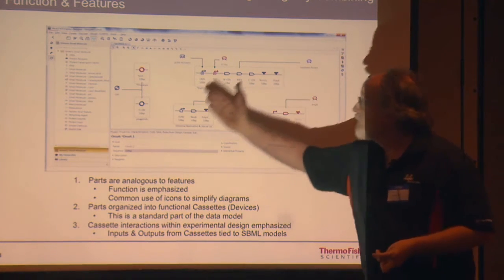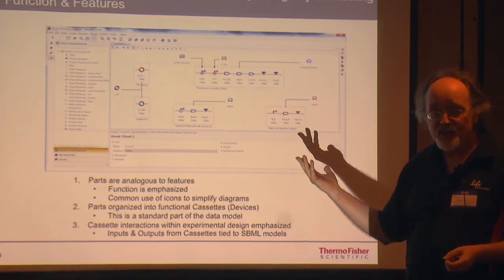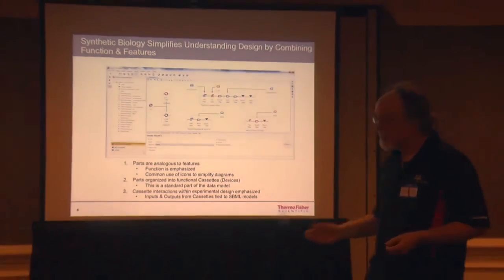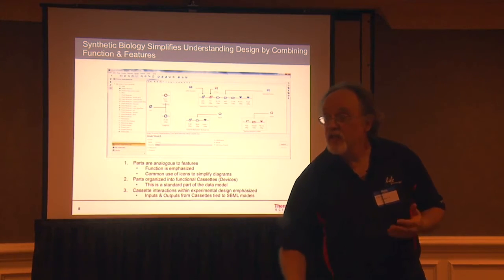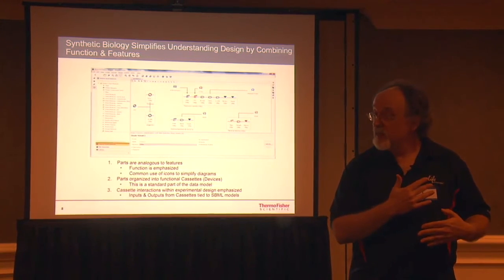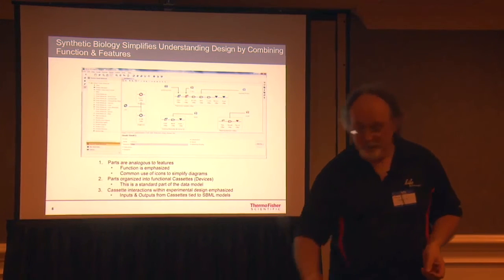But all of these are like software design patterns. These are design patterns that can be used for how you actually do your experiment. And again, one of the advantages we're seeing of open source software, particularly for helping us to develop these kinds of tools, is providing models of how you might create a design pattern in software and allowing us to translate that through standards like Synthetic Biology Open Language into how you would actually model biology.